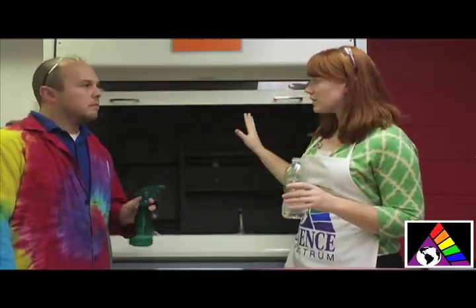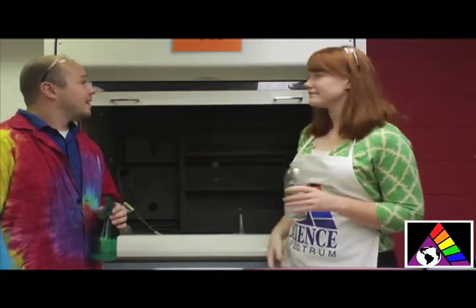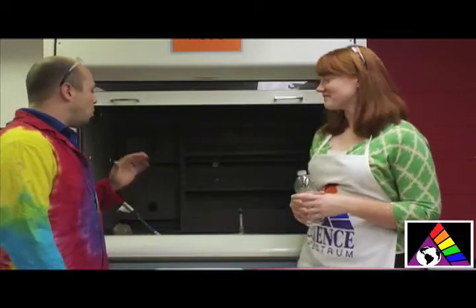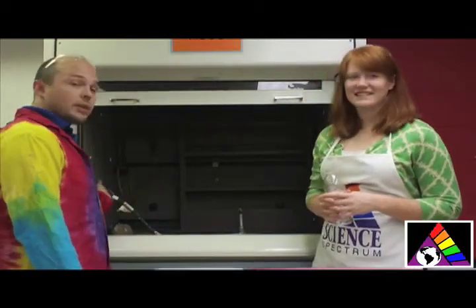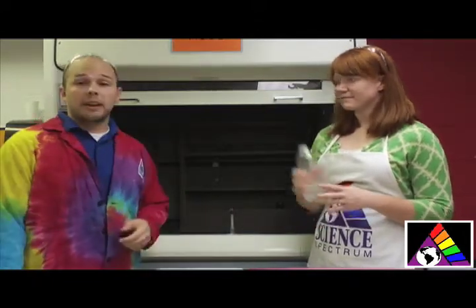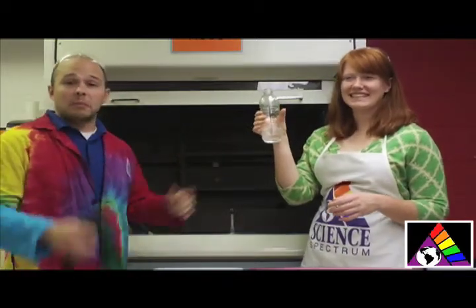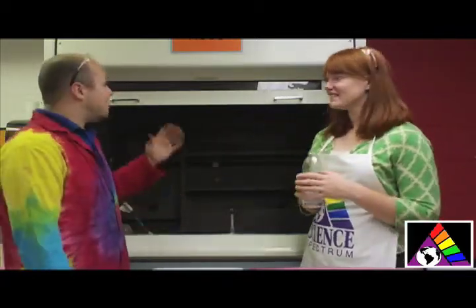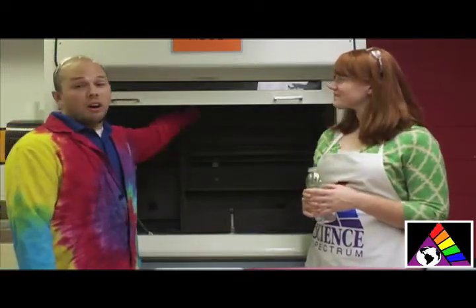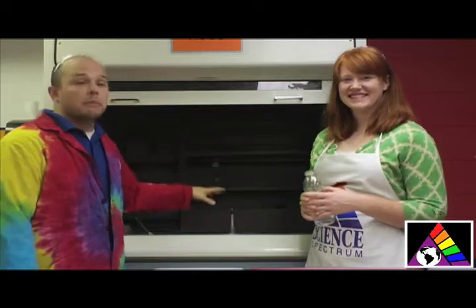And back here, we have our hood. This is a really cool piece of equipment that should be in any science lab. This is a vent hood, and the way it works is there is a gas hookup, and the gas comes out at the Bunsen burner, which you can then light and heat up chemicals, or in this case, spray chemicals at something and create fireballs. The vent hood also has this switch over here, which basically sucks out all of the fumes from anything we might burn, and keeps it from getting in our lungs.